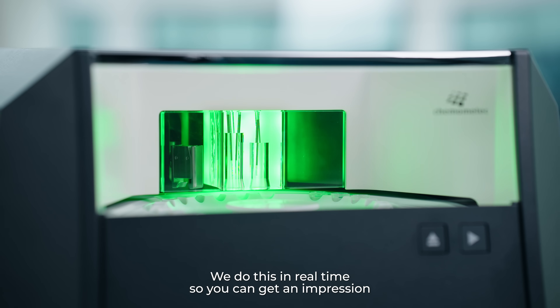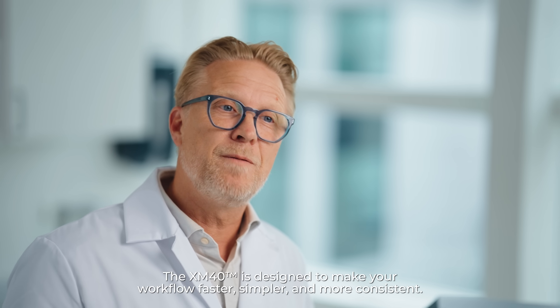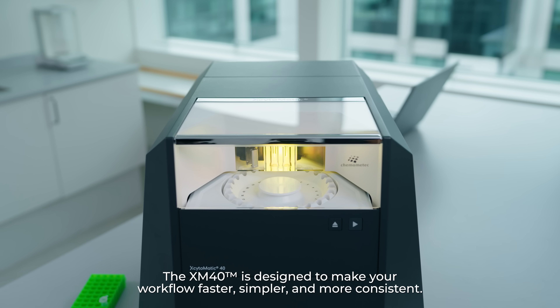We do this in real time so you can get an impression of the speed of the instrument as well as the function. The XM40 is designed to make your workflow faster, simpler and more consistent.